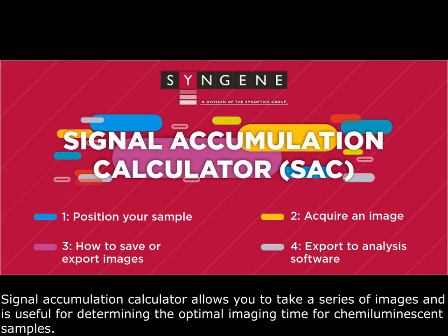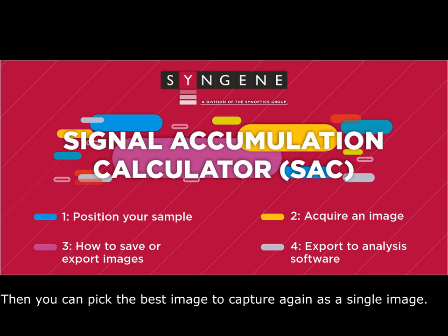Signal Accumulation Calculator allows you to take a series of images and is useful for determining the optimal imaging time for chemiluminescent samples. Then you can pick the best image to capture again as a single image.